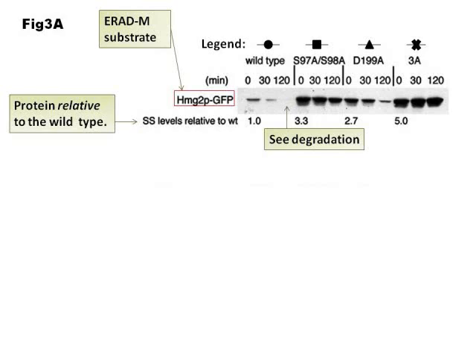The final heading, 3A, on the far right, is a combination of these three mutations in an HRD1P variant that resulted in no apparent change in protein levels after 120 minutes, appearing as a consistent dark band in the three last lanes on the gel. However, you might be thinking, what's black is black, right?